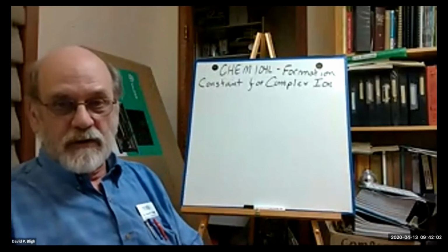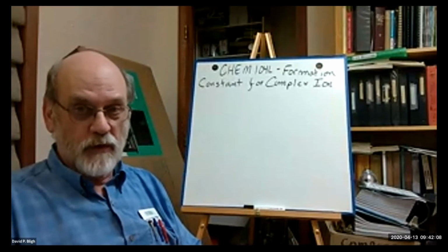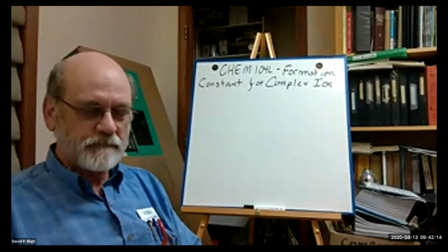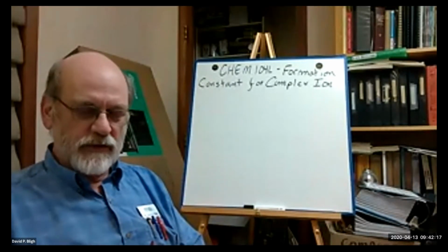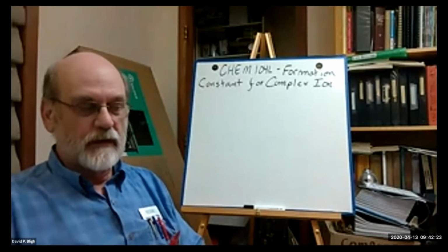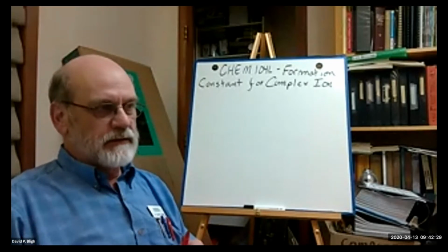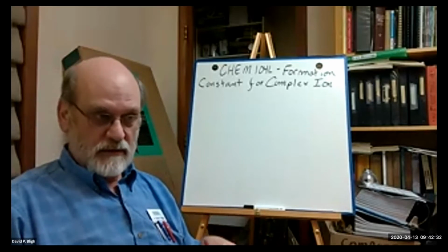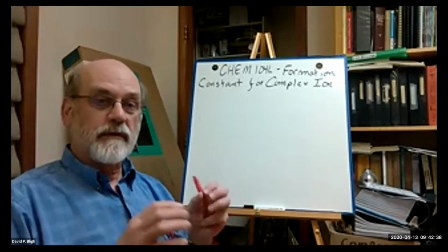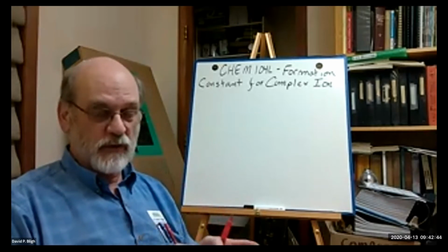Today, we're going to discuss a lab for my Chemistry 104 class, which is second semester chemistry. And the lab that we want to perform, and that I really would love to have you do hands-on, but we are preempted by the coronavirus. Because it's a very simple lab to do hands-on. The real challenge comes with processing the data. What do you do with the numbers when you get them? That's where we're going to spend most of our time.